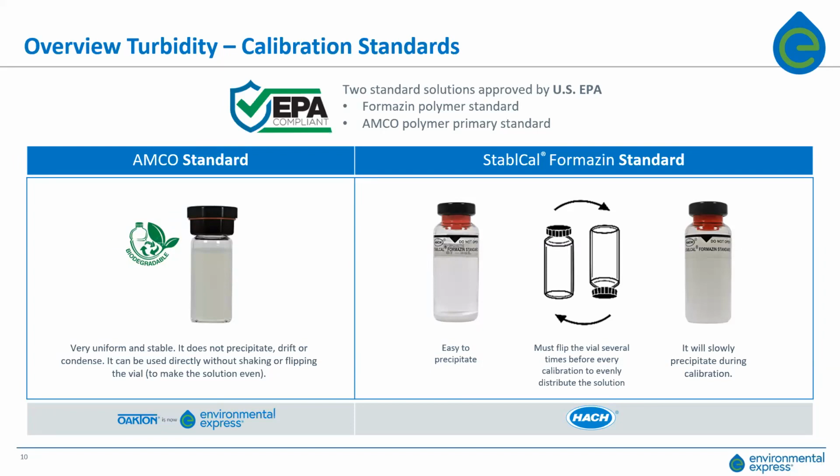NPDES and NPDWR regulations. It is a copolymer, essentially copolymer beads that are in suspension in this liquid. Very uniform, very stable. They don't settle out of solution.